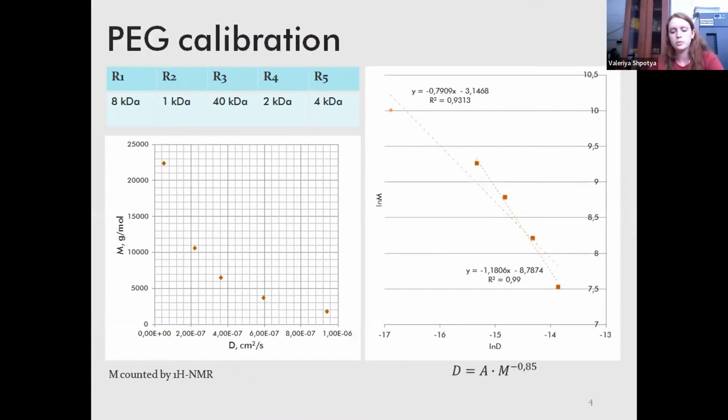So to begin, we performed those experiments for pure PEG solutions to ensure there are no impurities and to create a calibration curve. We discovered that 4 of 5 samples of PEGs are pure enough for our study, but the PEG with the highest mass contains more than one component, and so we decided to omit it from further mixing and composition.